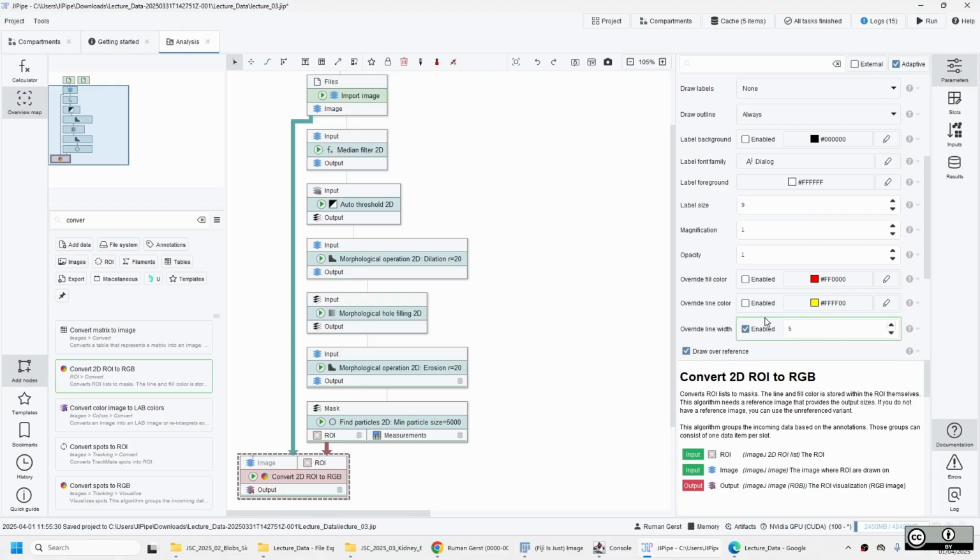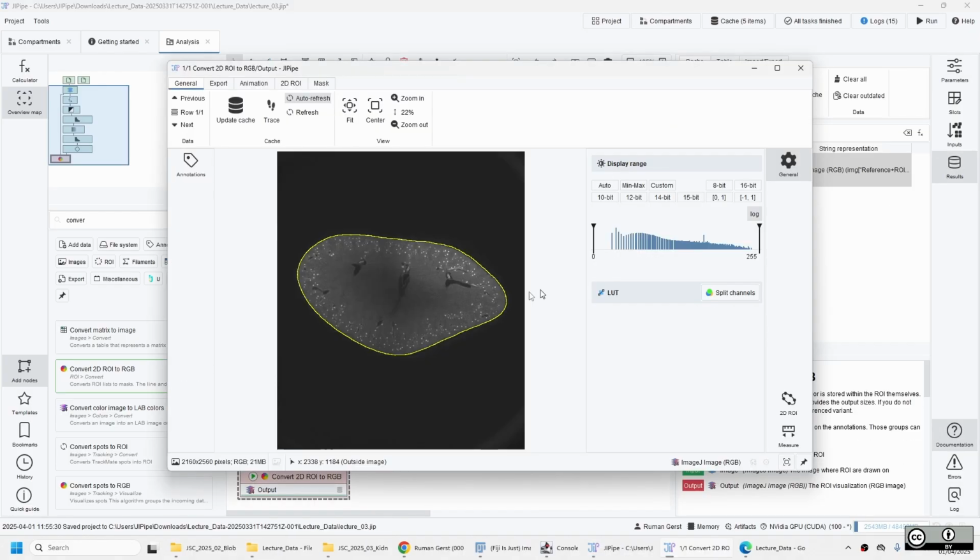You can also make the color different. This default color here is yellow. If the ROI basically has no color set, then it will opt to yellow. But you can also force it to something. And you can also add opacity. This is something that ImageJ doesn't do. So then this way you have like a nice outline that can be later on saved when I show you actually how to save stuff out.